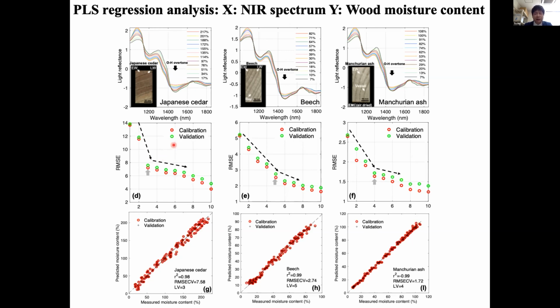The PRESS factor should be controlled as low as possible. It will help to improve the reproducibility of the image processing results after the PLS modeling construction. All the 3 calibration models were constructed with the LV numbers under 5.